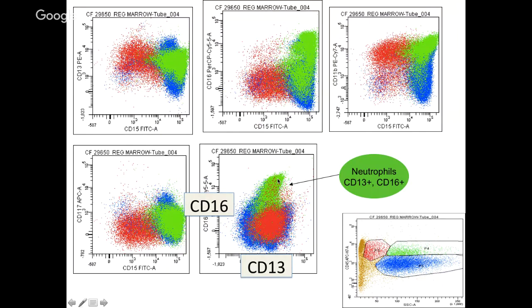Now this is a pattern which is extremely important for us to understand flow cytometry immunophenotyping, especially in cases of myelodysplastic syndrome, where these patterns get disturbed because you have fewer granules, you have more lobes, so the patterns of these maturations get disturbed. Those cases of myelodysplasia which cannot be picked up on morphology can be picked up by flow, since flow can easily analyze more than a million cells.